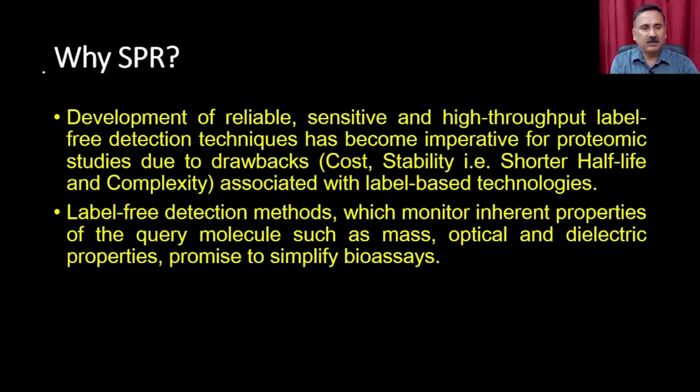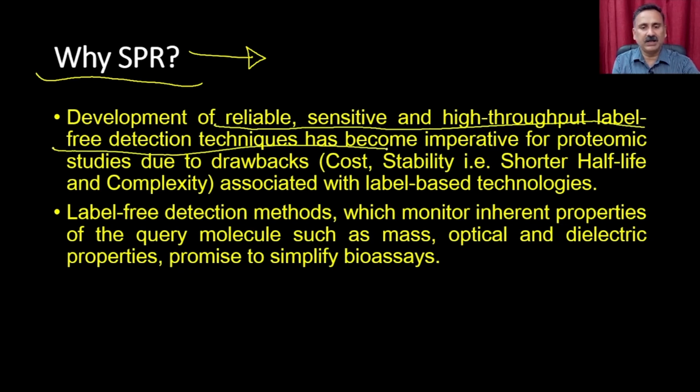But the question is why we need an SPR. Okay, we need an SPR for many reasons. One is we have to develop a reliable, sensitive, and high throughput label-free detection technique.